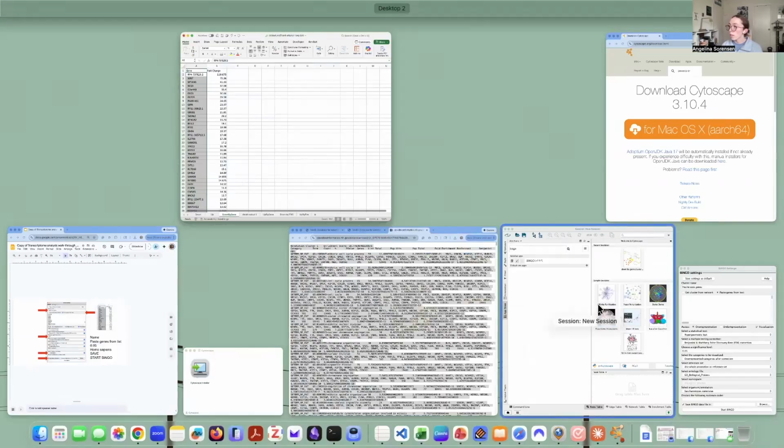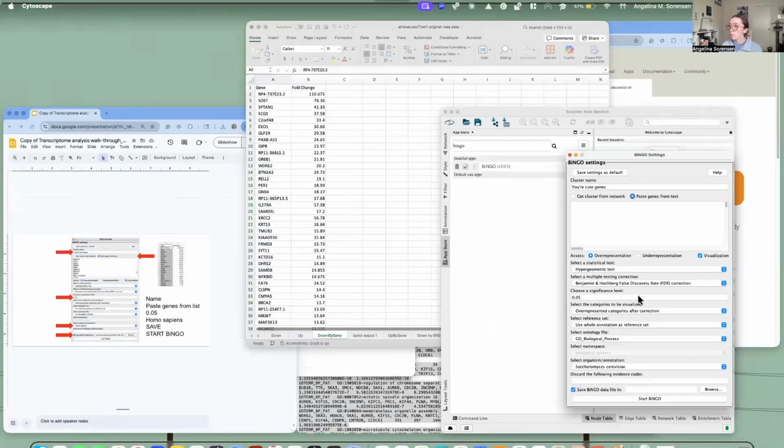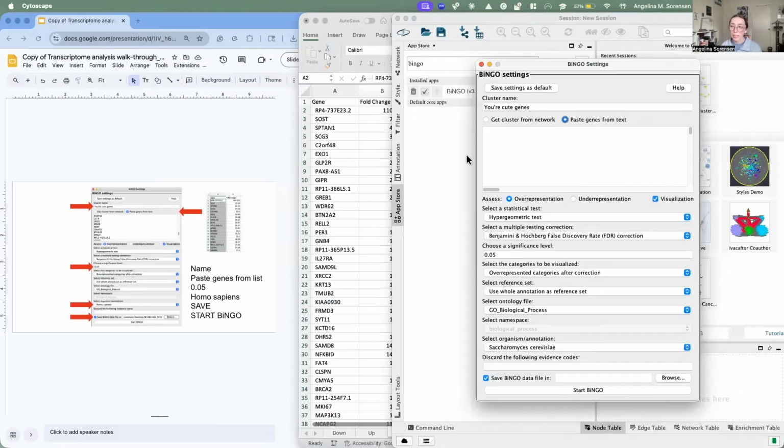I'm going to go back here to this screen. Again, I know this is many windows. If you can do this at home where you have multiple screens, I definitely recommend doing that. Or if you are an iPad person and you can have an iPad with you and use Sidecar with your laptop, anything like that, I think is super helpful, just because it is a lot of windows to manage at this stage. But if not, it's all totally doable just in class during normal class time. It just does take some clicking around.